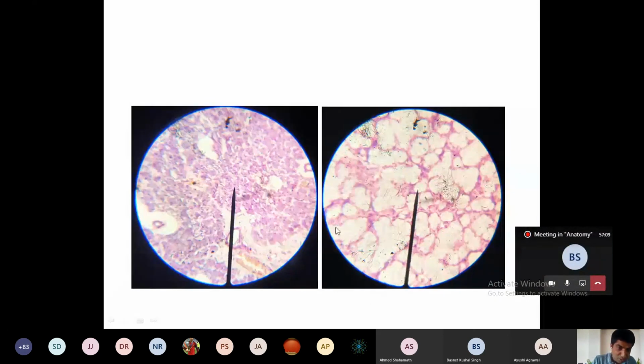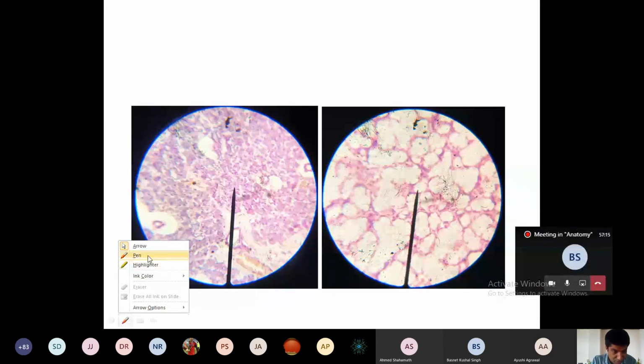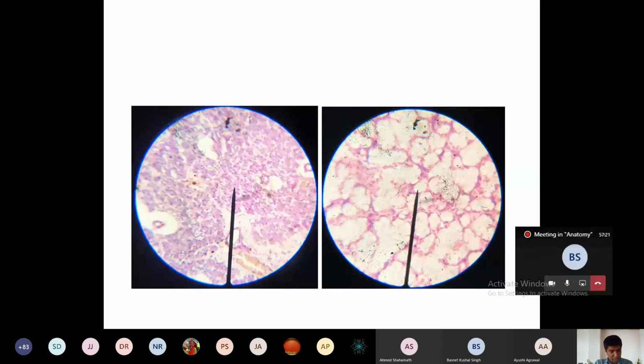After this, what is left? Yes, glands. Even glands are also there. Time is very less, so I'll quickly tell you. Just identification I'll do. Cardinal features you can write. This is which gland? This is the mixed gland. Sorry, this is the serous acinus. You have to write acinus. Okay, this is the serous acinus. Find out the cardinal features in the textbook.